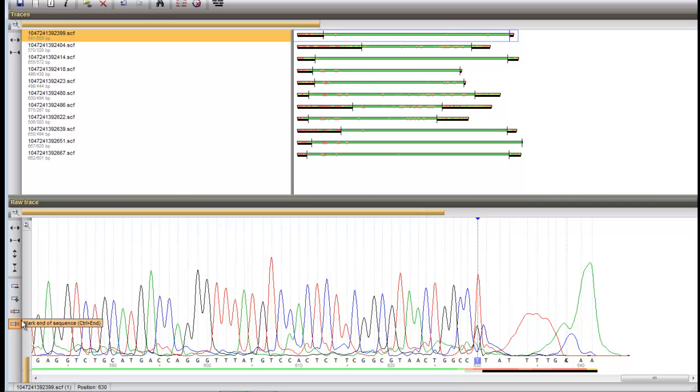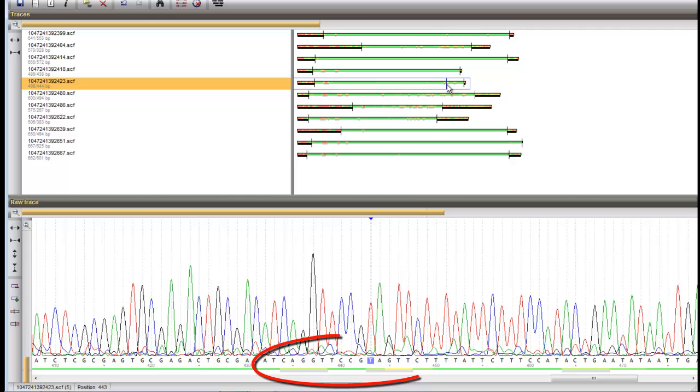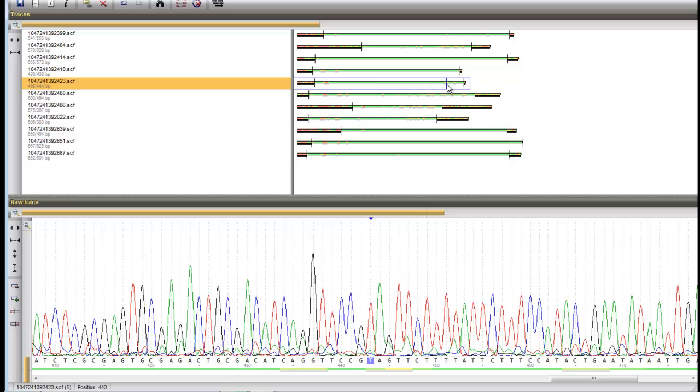Inside a sequence, there also may occur regions of less quality. These are indicated by a yellow or orange color and are underlined by a gray bar. This gray bar defines an inactive zone.